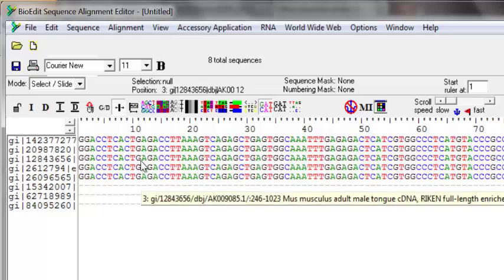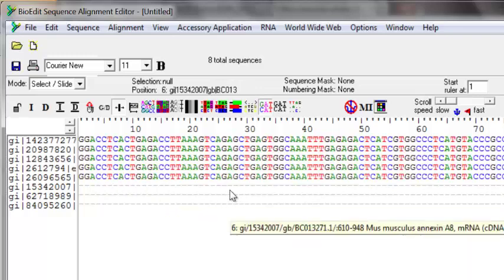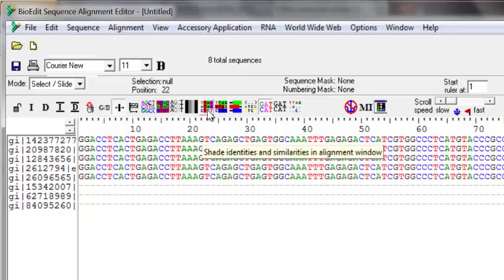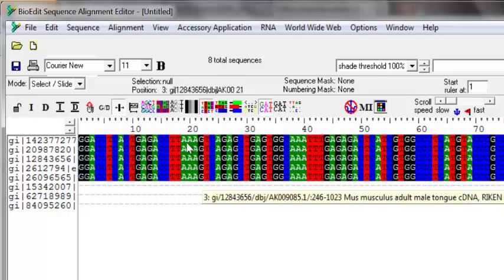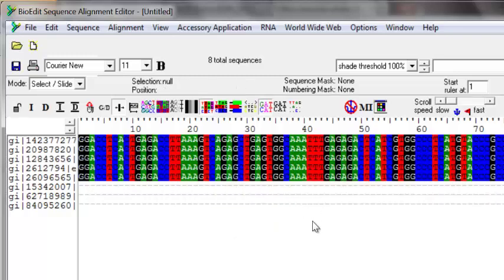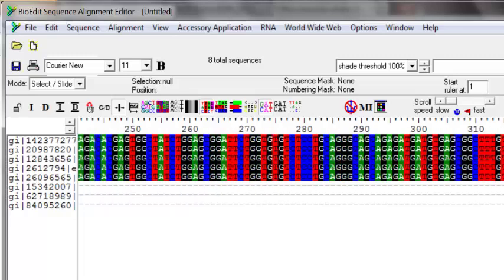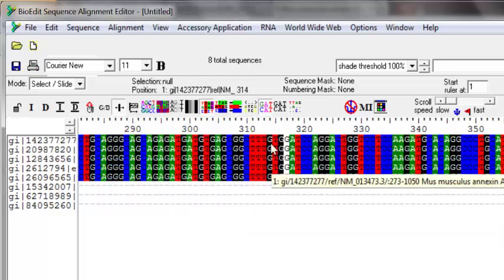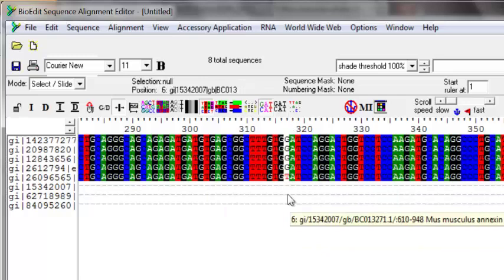You can see that they are pretty well aligned and you can highlight them by pressing the 'shade identities and similarities in alignment window' button. What it does is color the background of each base a particular color — A's are colored green, T's are red, C is blue, and G is black. The most common use of this function is when you are trying to look for mismatches, and any column which has a mismatch is not going to be shaded.